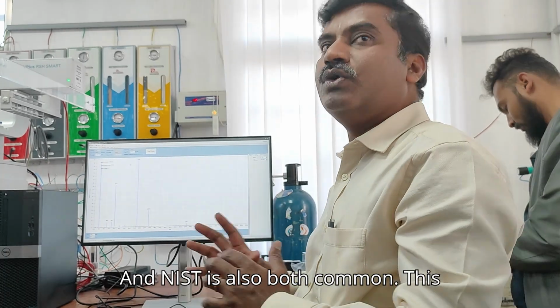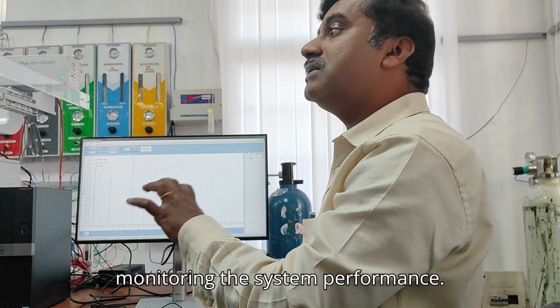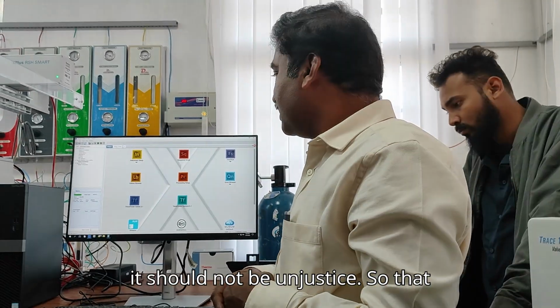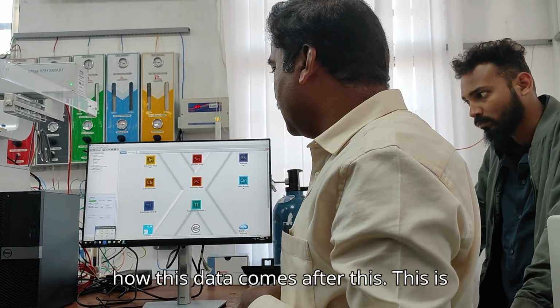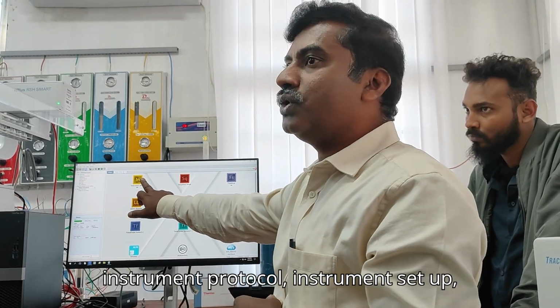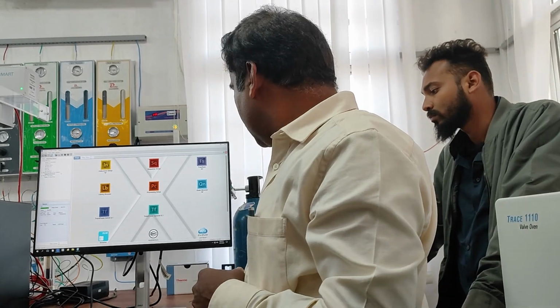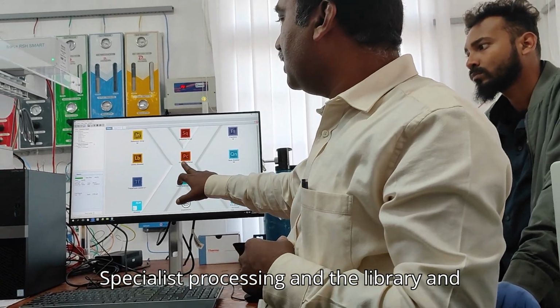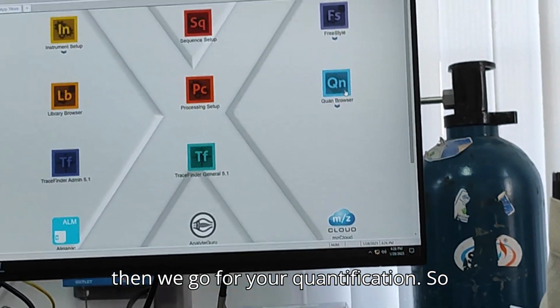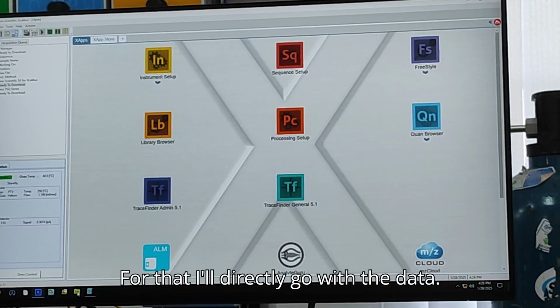And NIST is also common. This is clear? So this is how we monitor the system performance. I'll show you some data, how this data comes. After this is the roadmap: instrument protocol, instrument setup, sequence setup, the injection list, processing, and the library, and then we go for quantification. We'll go through everything one by one. For that, I'll directly go to the data.